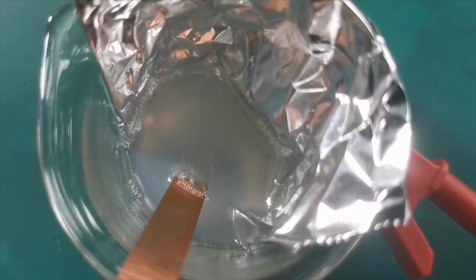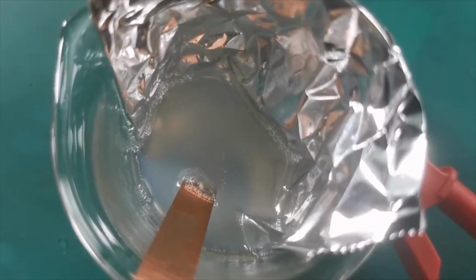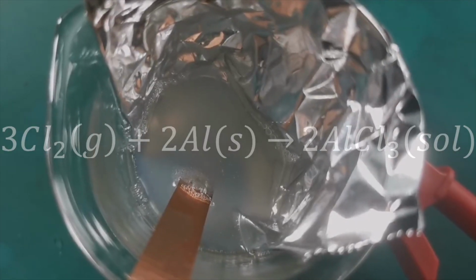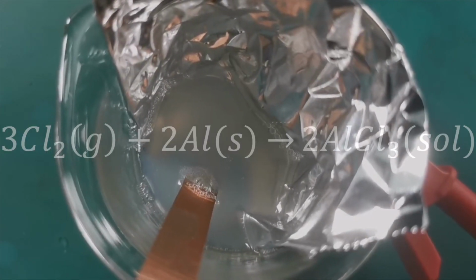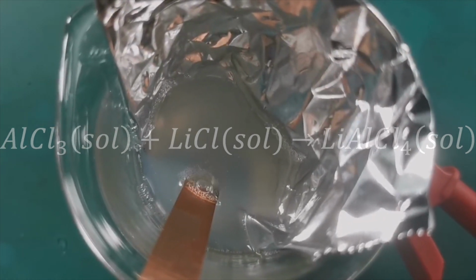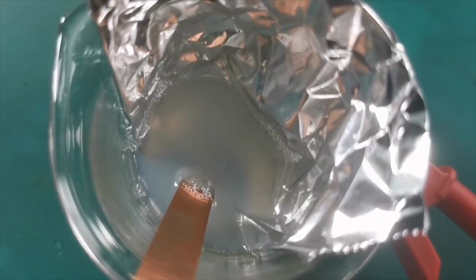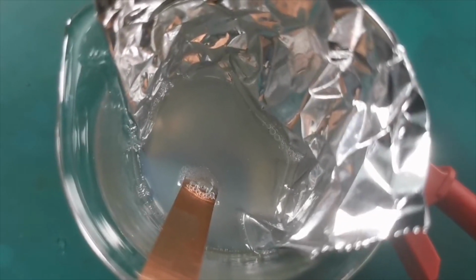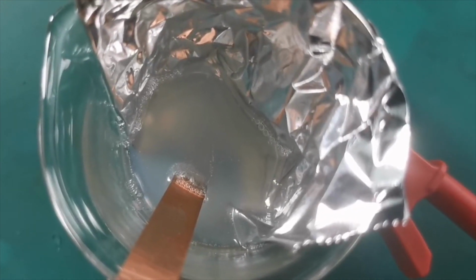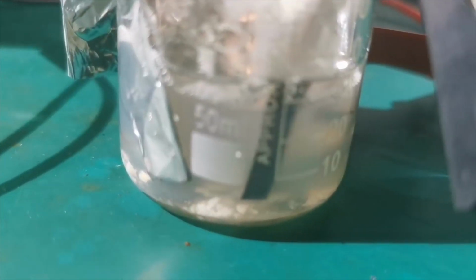The first method is the in situ generation of aluminum chloride. The aluminum anode we use can react with the chlorine produced in the electrolysis to form aluminum chloride, which then reacts with the extra lithium chloride present to form a complex that has a much larger solubility. Also, since the chlorine is always generated no matter what the electrolyte is, the aluminum anode can produce more aluminum chloride along the way, making the reaction go faster and faster over time.